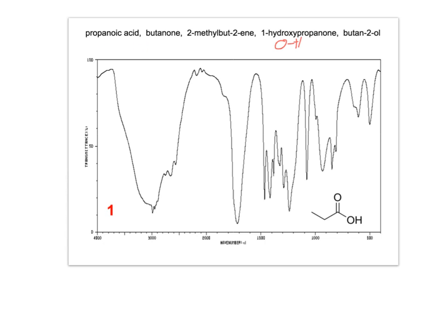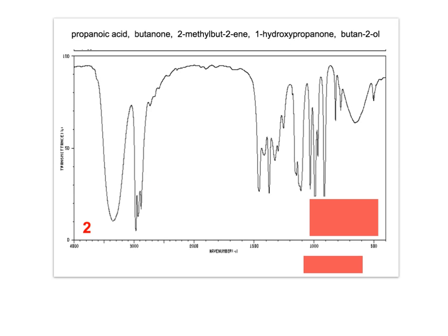Both of these would have similar spectra. It's propanoic acid because the OH is joined up to the CH bond here. Also, the OH for acids is slightly to the right. So if you look at its wave number for the acid, it's shifted to the right. If it was an alcohol, it would be more to the left. So pause the video and have a go at this one.